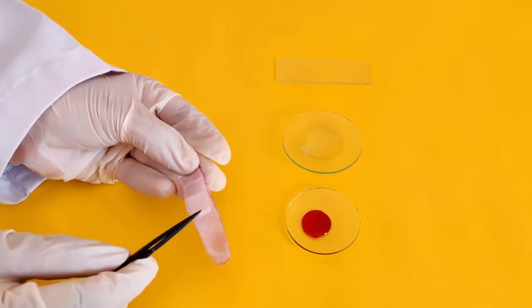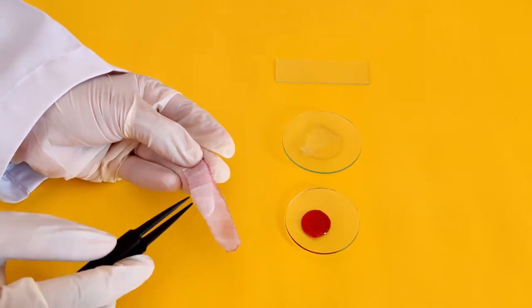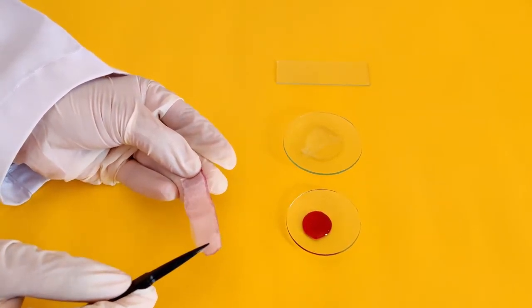Using the tweezers, peel off the thin white film from the epidermal layer inside the onion.